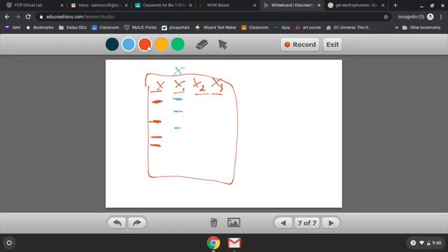Let's say here is the best friend. Okay, now you got scared. You thought the best friend was the culprit here, right? Because one, two, three patterns match, but this last one does not. This last one does not match this, right? This person has a piece that's way heavier than this piece. And so that means that person's out.